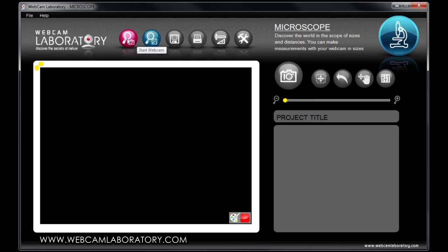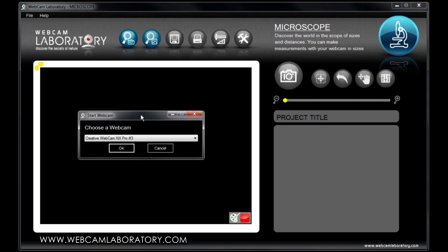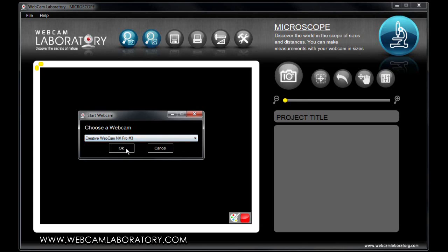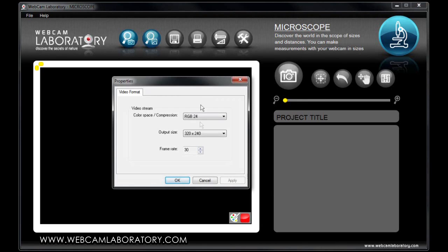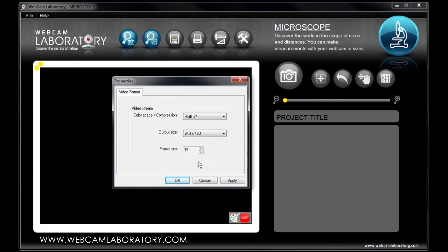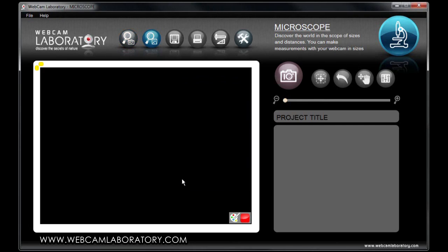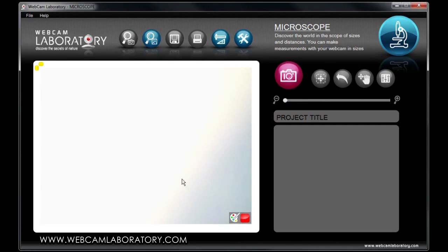Let's start by selecting the webcam by pressing the Start Webcam button and using the pop-up menu. After this, another pop-up window will appear where you can select the desired resolution. In the case of the microscope function, you should use the highest resolution possible, so you will have a more detailed picture when you want to zoom into it.